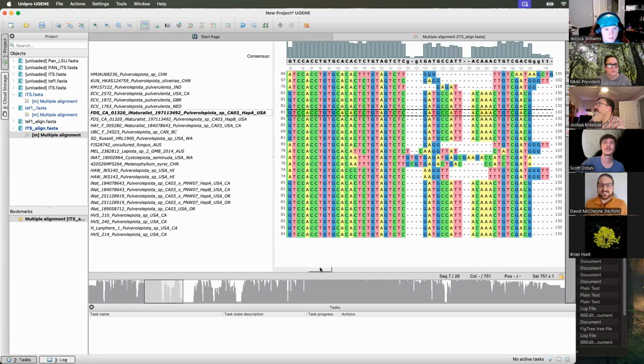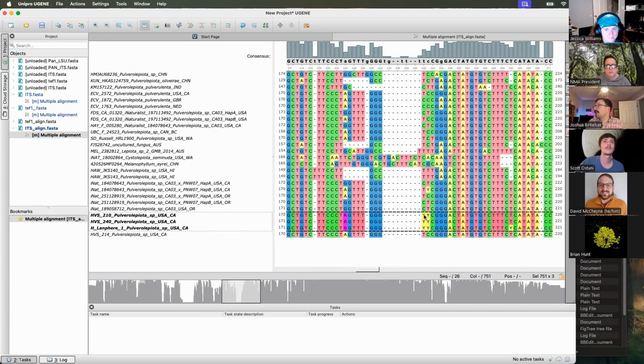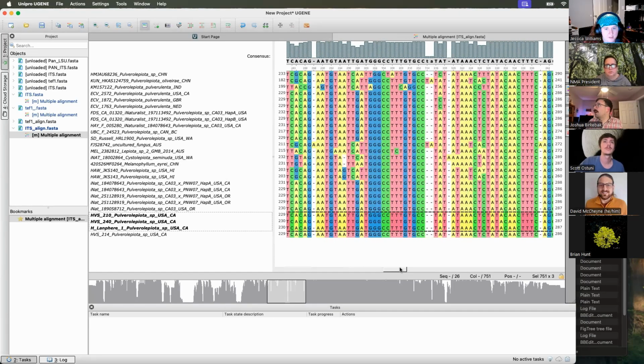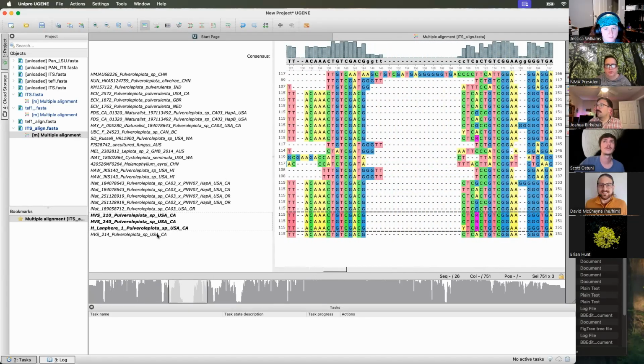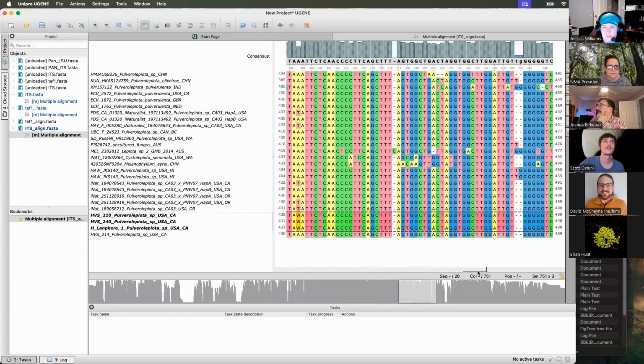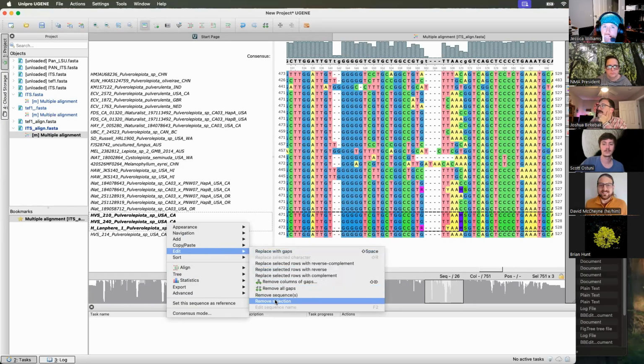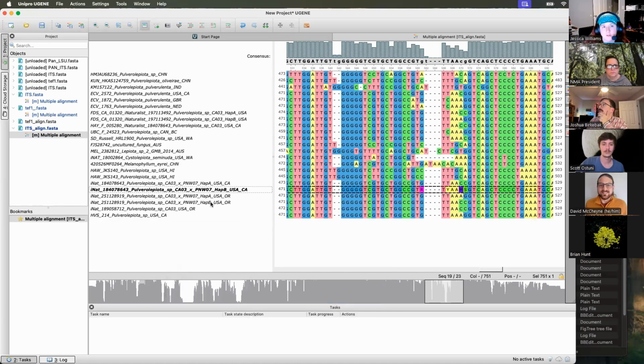And then I also want to go through and remove Steve's ones from Helen. Well, or at least these ones, which are clearly conflated haplotypes, because we've got our R's, our Y's. Looks like one of her collections might be like a purebred, for lack of a better way to put it. If it's the PNW05, I would like to see it rerun on Nanopore because I was looking at it and there's some frame shifts in the chromatogram that are just evil.